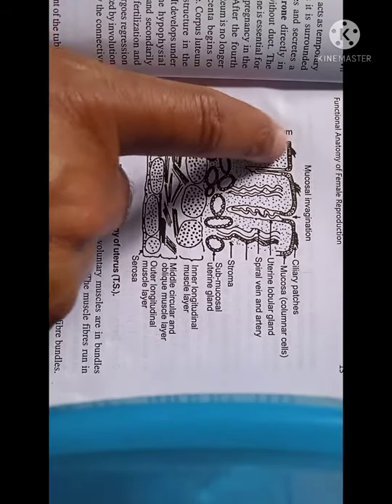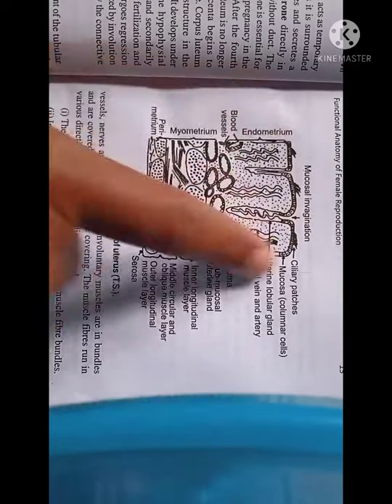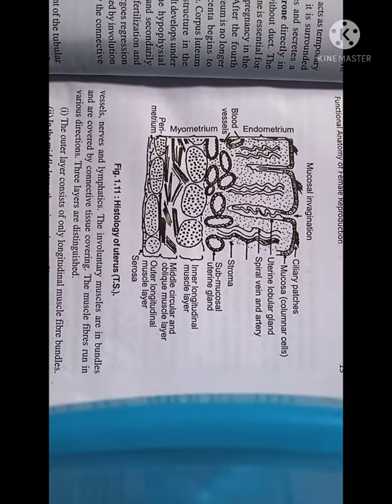Then the third layer, the endometrium. You see, this is the endometrium layer. It is the innermost layer of the uterus, which is thick and occupies almost all of the lumen. This layer undergoes cyclic changes in structure and secretory activity in response to the menstrual cycle. The major changes lead to tissue necrosis and hemorrhage, and the process is called menstruation.